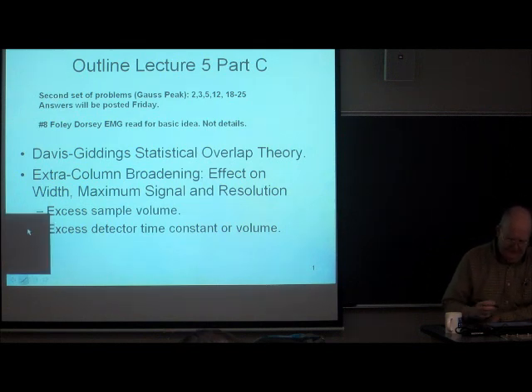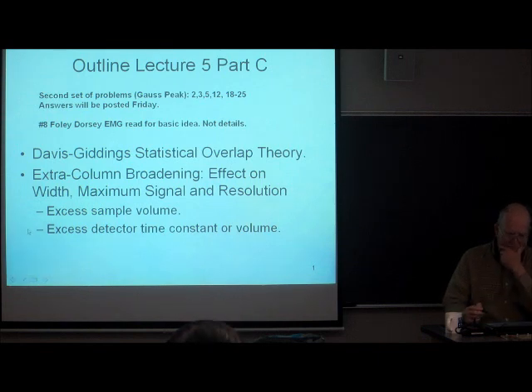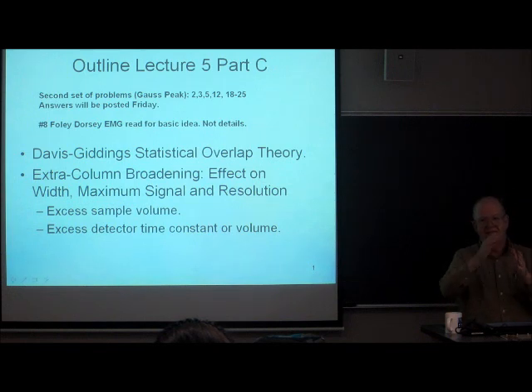So this approach, I gave you the reference the other day. We started with a 1985 paper by Cal Giddings and Joe Davis. There must be at least 50 papers that follow on from there, elaborating the ideas in greater and greater detail, going from simple one-dimensional separations, which is what we're talking about now, into multi-dimensional separations.